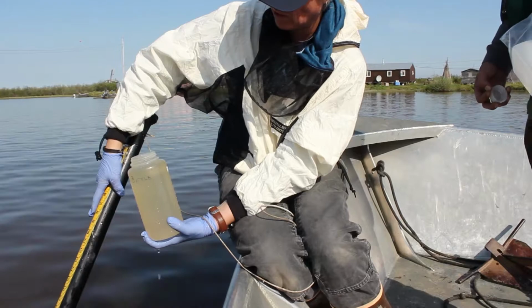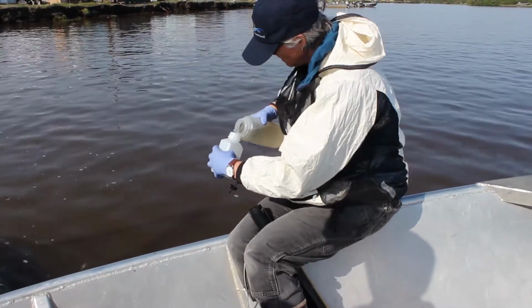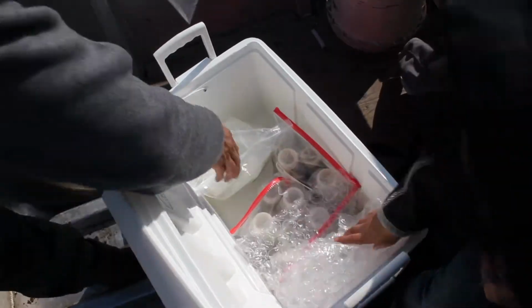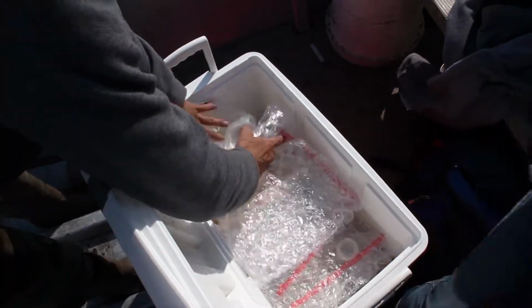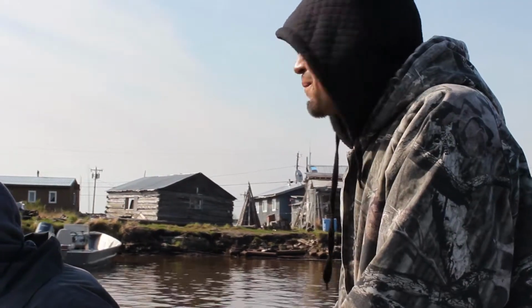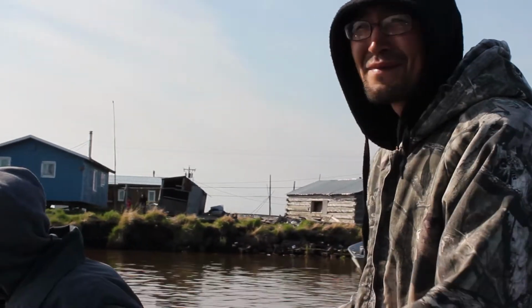Take the bottle off the pole and pour the water into the sample bottle provided by the lab. Cap the sample bottle, put it in a Ziploc bag, and place it in the cooler. Now that you've collected all your samples, it's time to head back to the office and prepare the cooler for shipment to the lab for analysis.